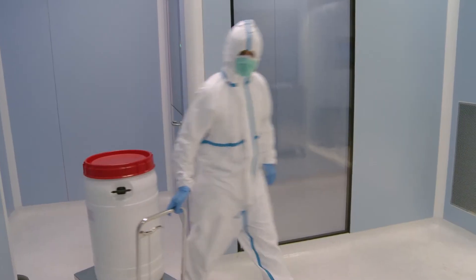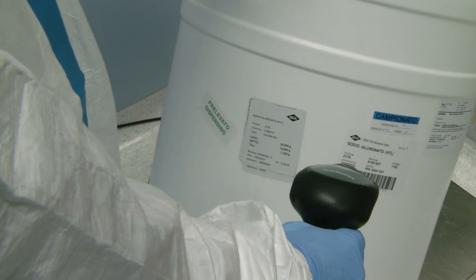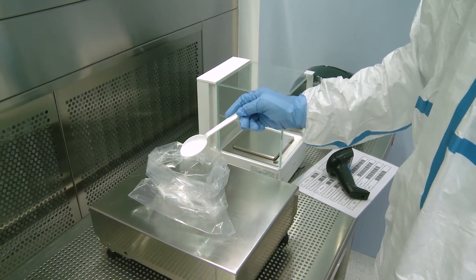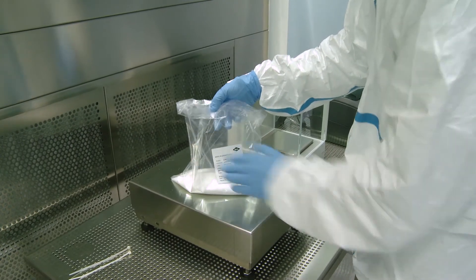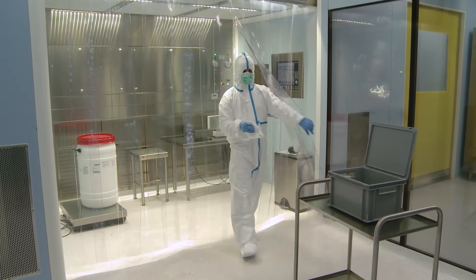The preparation of Gelsin-3 begins in the dispensing department with the recording of the individual weighing of raw materials. The sodium hyaluronate used for Gelsin-3 is produced by fermentation of the cell strain Streptococcus equi.